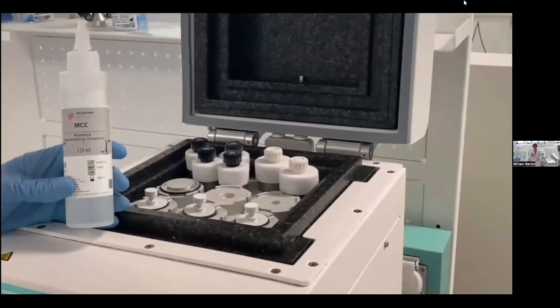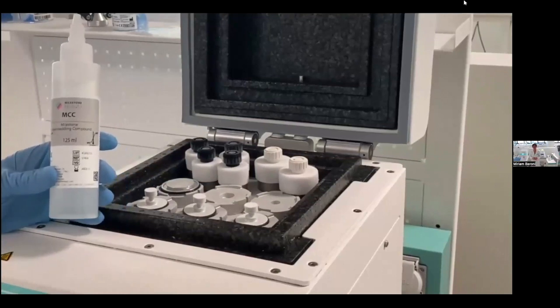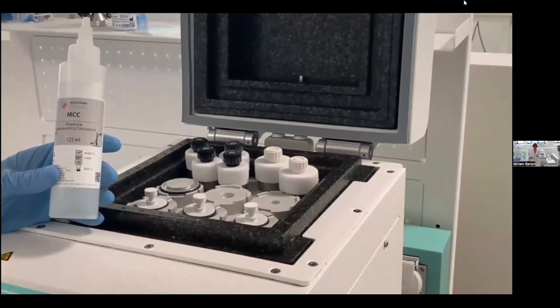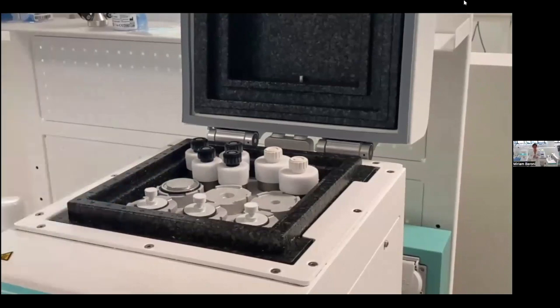This allows me to use a medium that is more liquid than a conventional medium. MCC improves the transfer of the sample into the mold, but also creates the perfect connection between the frozen sample and the surrounding medium.